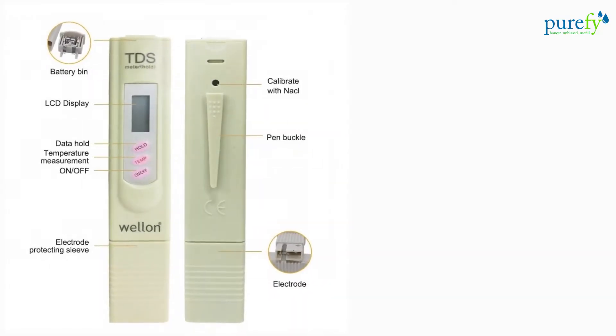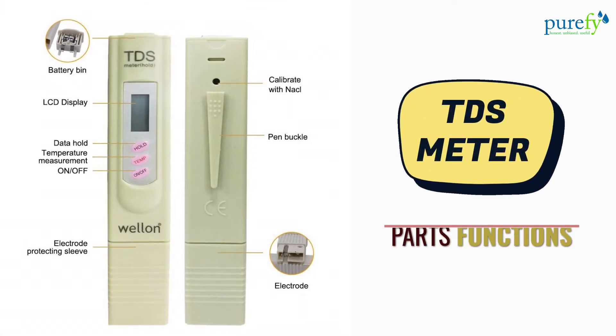This picture shows all the parts and functions of the digital TDS meter. The TDS meter features three buttons: on-off, temperature, and hold. The on-off button is used for turning it on or off. The temperature button is used for measuring the room or liquid temperature and to switch between temperature and TDS mode. The hold button is used for holding the reading after a measurement.